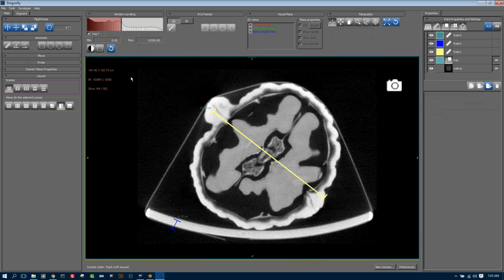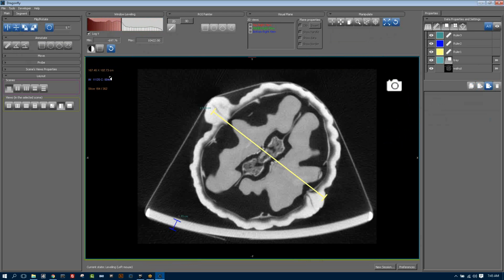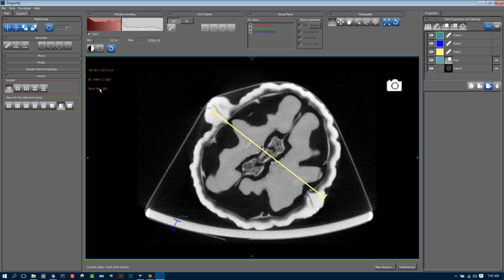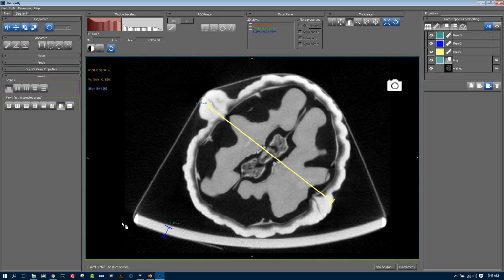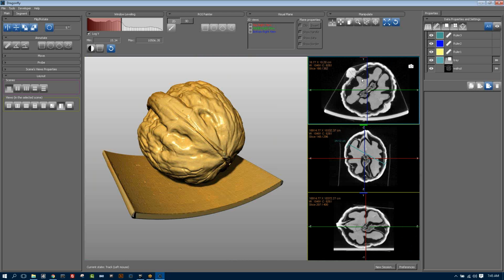You also have what we call text presenters on screen. The text presenter for window level allows me to drag like I'm in leveling state, where I can drag horizontally or diagonally. But you also see a text presenter for the field of view, so I can zoom in and out, and a text presenter for the slice, so I can change the slice number I'm looking at. Now if I double click, it goes back to a smaller view, and now I have all of these views again.